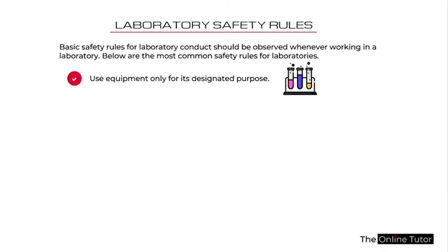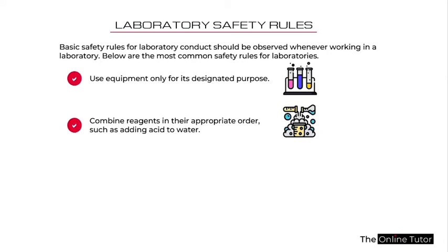The next one we want to look at is the use of equipment for its designated purpose. Use a beaker for what a beaker is for, use a burette for what a burette is supposed to be used for, and use test tubes for what test tubes are supposed to be used for. Don't use your burette to stir solutions. Your burette is not meant for stirring solutions. Don't use your pipette to stir solutions. Don't use your mouth for sucking or doing suction when you are carrying out an experiment. It is not good for you. So use equipment for their designated purposes. That is very, very important.